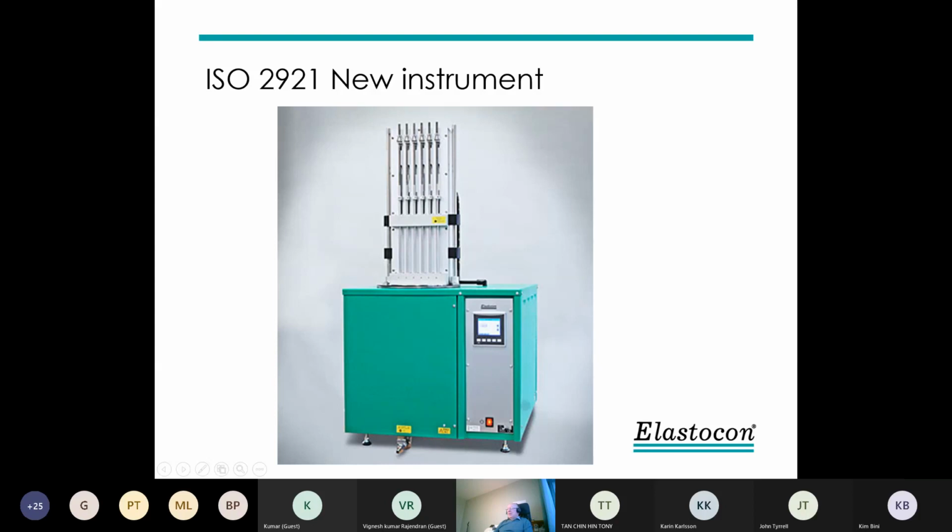Here is also the 6 test piece test rig, which is lowered into an ethanol bath. By the way, we had a customer in the US once who wanted to have silicone oil in the bath. We had to make some modifications to allow that, and then we sent the instrument to the customer in the US, and after a year they complained that it's leaking. We get silicone oil below the instrument. So we even had the service guy going there and replacing the whole container for the liquid. And we got it back and investigated it, and there was no leakage. But if you use a silicone oil at low temperature, it has to have enormously low viscosity. And silicone has a tendency to creep upwards. So it creeps up along the walls, over the edge, and then down on the outer side of the container and comes out below the instrument. So I don't recommend silicone, even if it's good for one reason: it doesn't burn.